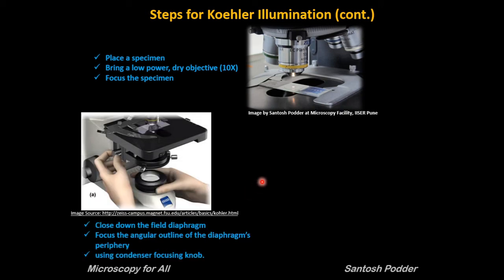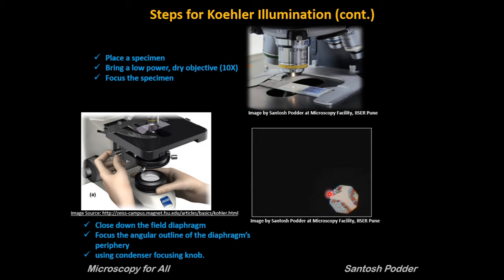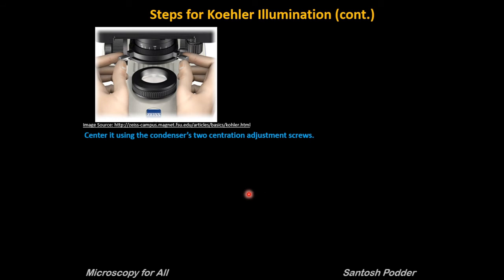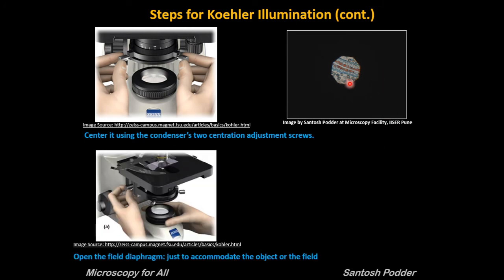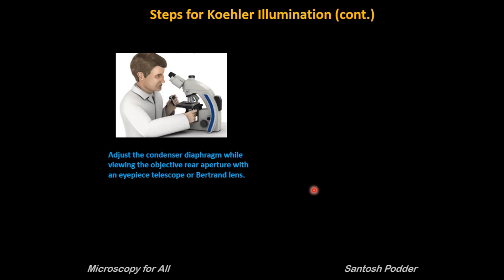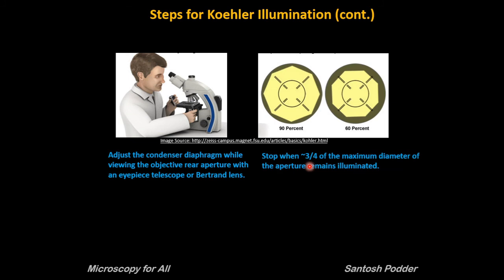Then close down the field diaphragm and try to focus the angular outline of the diaphragm periphery using the condenser focusing knob. If the condenser is not aligned with the light path, the image of the field diaphragm will appear at the periphery rather than the center — so you will need to do condenser centering. Center the condenser using its two centration adjustment screws to bring the image to the center. Then open the field diaphragm just enough to accommodate the field of view. Finally, adjust the condenser diaphragm while viewing through the objective rear aperture using a Bertrand lens or telescope lens, opening the condenser aperture to approximately three-quarters of the diameter.